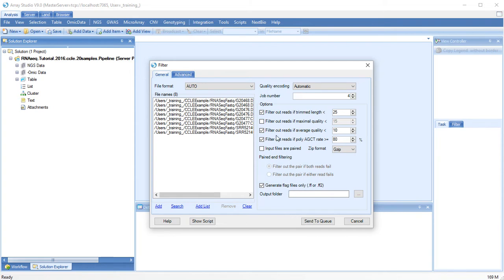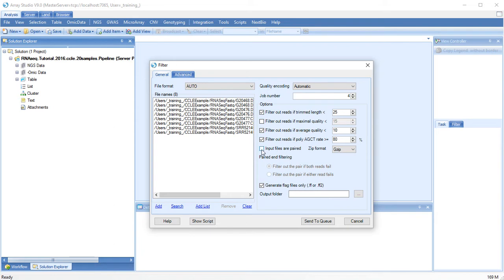The first set of options will filter out reads that are too short or have low quality or have high frequencies of a single nucleotide. If you have paired-end data, you can also filter if both reads of the pair fail or if either one fails.